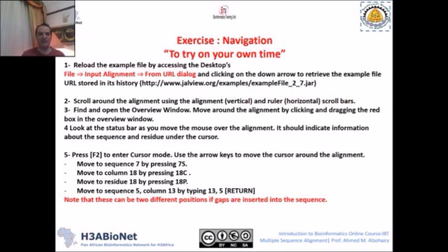This will allow you to practice some of these options and capabilities, to know more and be familiar with them, and to try how to reload some sequences, how to scroll using the cursor mode or even the normal mode, how to switch from normal mode to cursor mode, and also how to move and reach a specific position in your sequence, specific column, specific sequence, and so on. Anyway, try to exercise in your own time, and let's go to the next lecture.